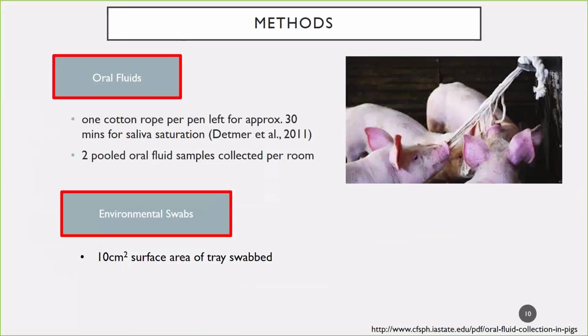We also collected environmental swabs, where we took a flock swab and swabbed a feeding tray. Next slide.